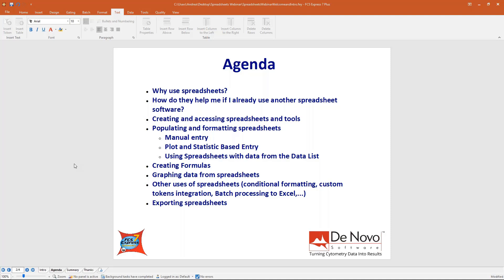Why use spreadsheets? Because you often need to make calculations like the ratio between two populations, or calculate a formula like the staining index, or calculate a regression between a drug concentration and retrieve the IC50. Basically, for the same reasons we use spreadsheets every day outside FCS Express. And if you already have Excel spreadsheets, converting them is very easy because FCS Express gives you access to the same formulas, mathematical functions, and statistical functions already in Excel.